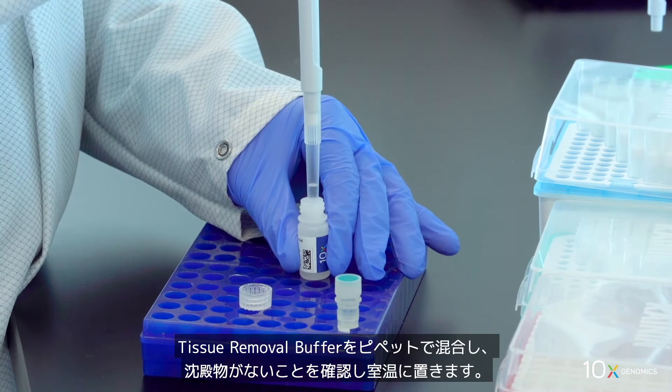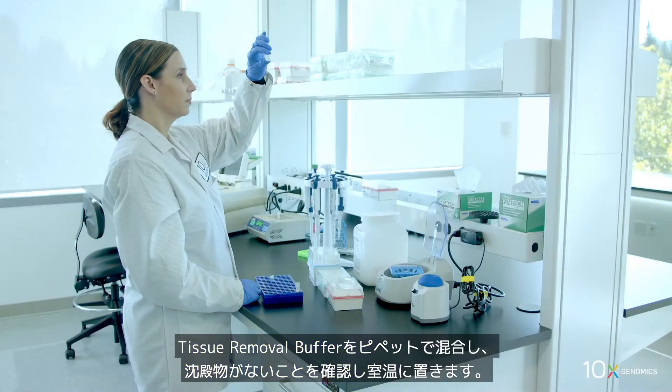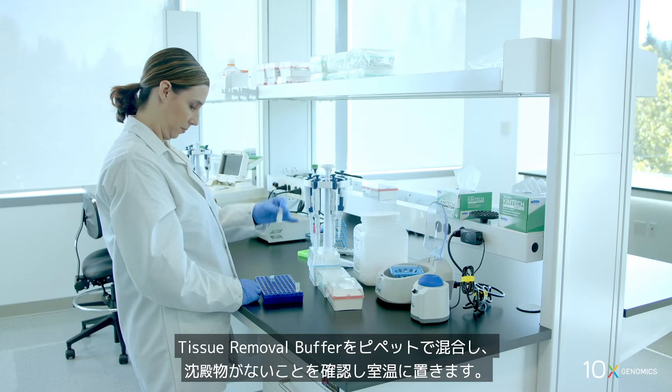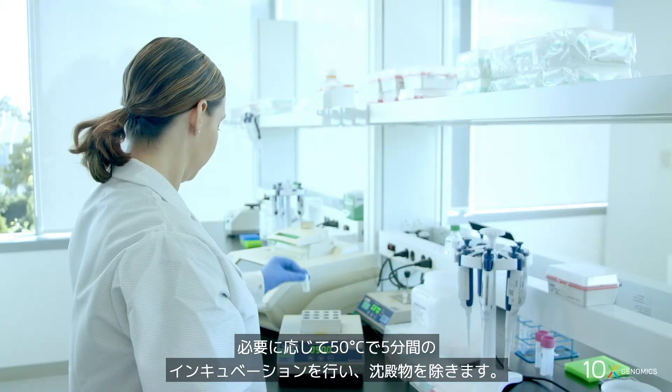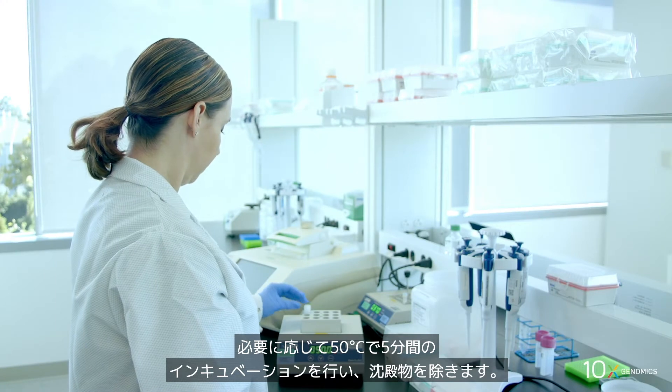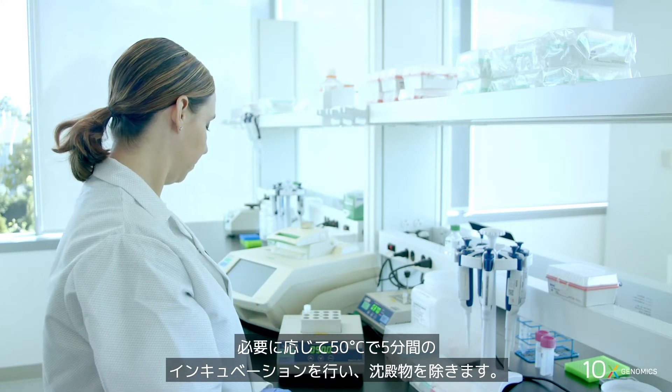We pipette mix the tissue removal buffer, verify there is no precipitate, and store at ambient temperature. If necessary, heat at 50 degrees Celsius for five minutes to remove precipitate.